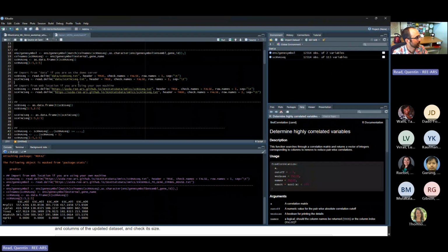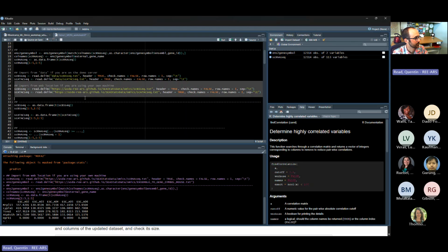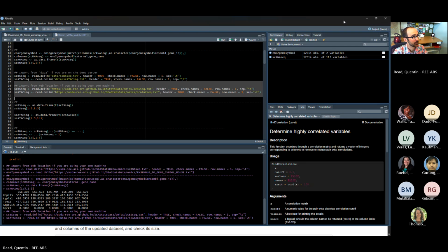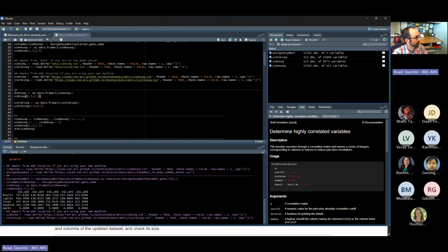So we're gonna import using lines 29 and 30, run that to import those two other data sets from the location on the web where I posted them. Okay, and let's look at the bisulfite one, run these two lines, the methylome one.